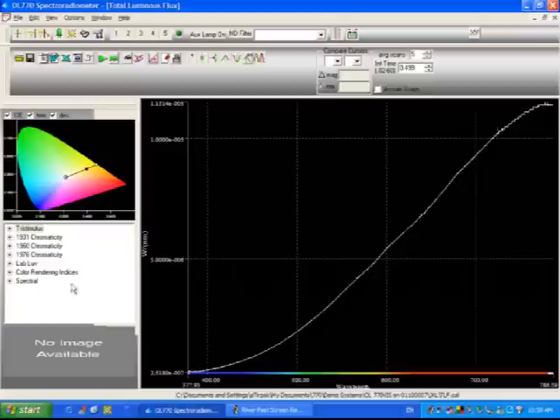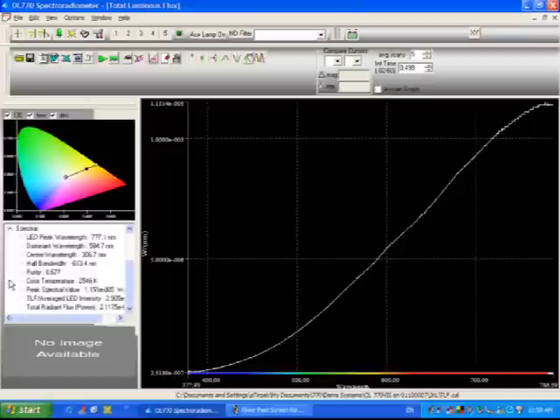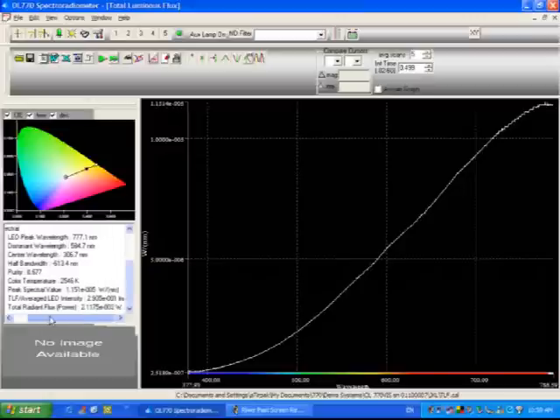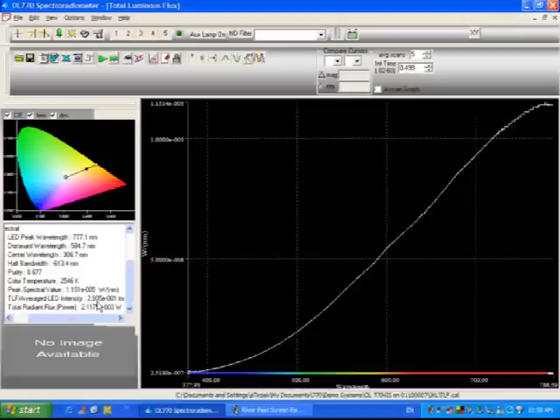If we wanted to get the total luminous flux value, it would be in our value tree over here under spectral, and we have our tlf value is about 290 millilumens, which is typical for this lamp. And that's all there is to taking a tlf measurement.